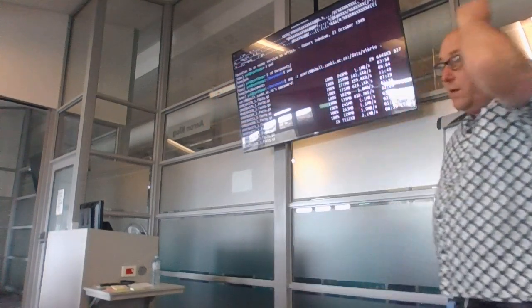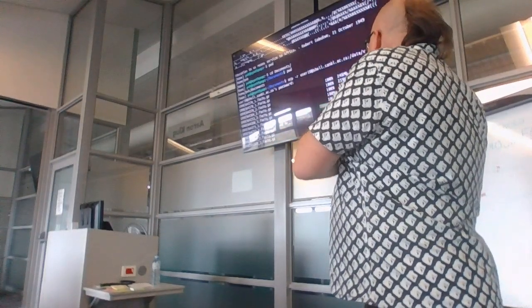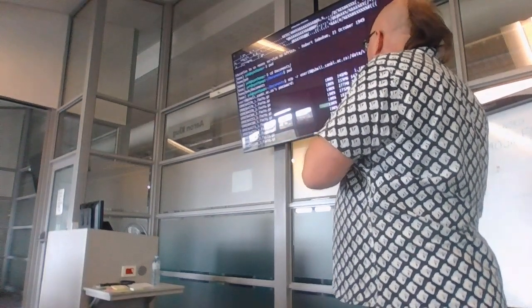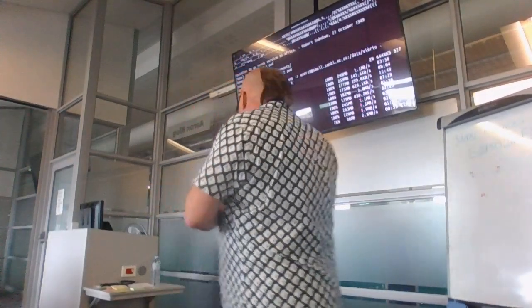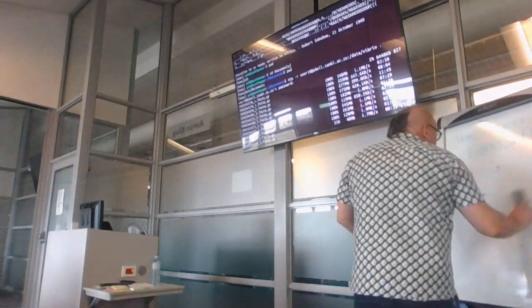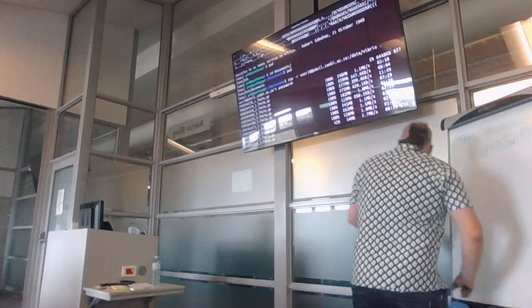Okay, so we're nearly ready to go. The next thing is, I said we're going to deal with reference-guided processes. So what are we dealing with here? Where do we want to end up?